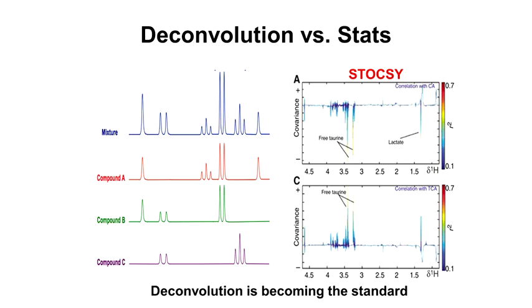And as I said, the difference is whether people choose to do the statistical methods, the chemometric methods, or whether they choose to do deconvolution. For me, it's still shocking, but probably two-thirds of all NMR metabolomics papers use this approach, when I think even the originators feel this is outdated and have moved largely to this approach.